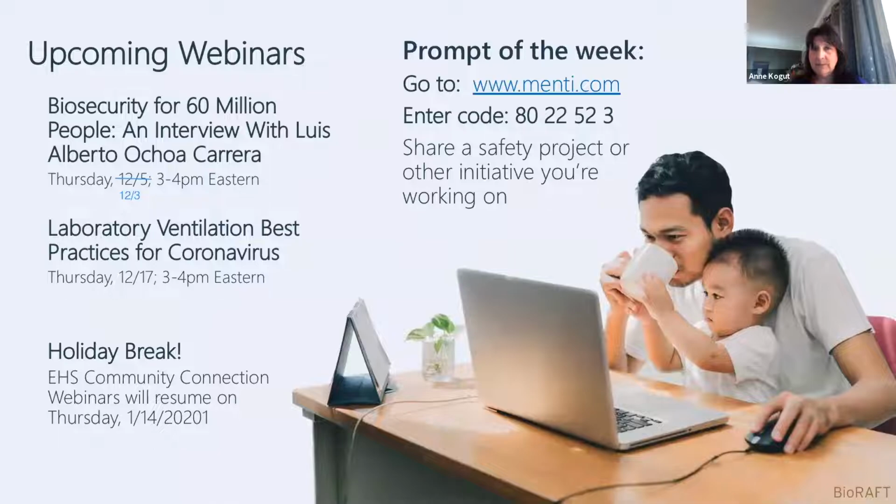The challenge has been, and I don't know if anyone else has had this issue, that we have a lot of disinfecting and sanitizing we're having people do, and maintaining the safety data sheets for those particular chemicals. There are a lot of people using things who really weren't trained in HAZCOM, and it's been a challenge. That's actually something they're seeing a lot of citations on, not maintaining the data sheets for these cleaning products that people are using.